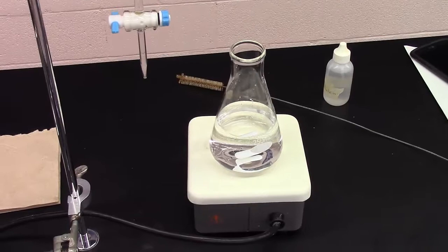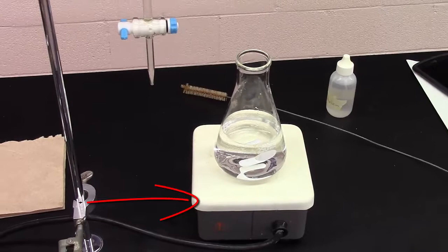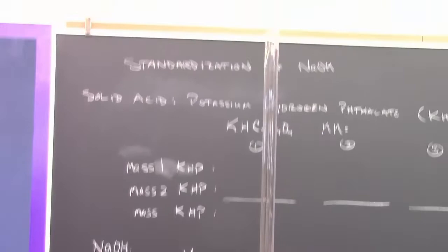We're going to show you some of the basic equipment. My acid to start will be in this flask. Normally I'll just hold the flask and swirl it, but I have a magnetic stirrer that's going to do that work for me. Just to the other side is a burette, and here's the working end. The burette is a tall tube that has graduations on it.